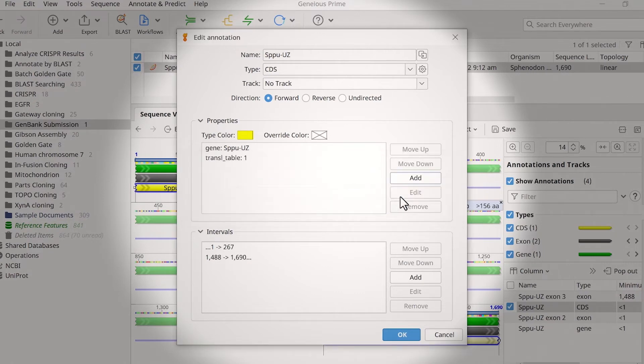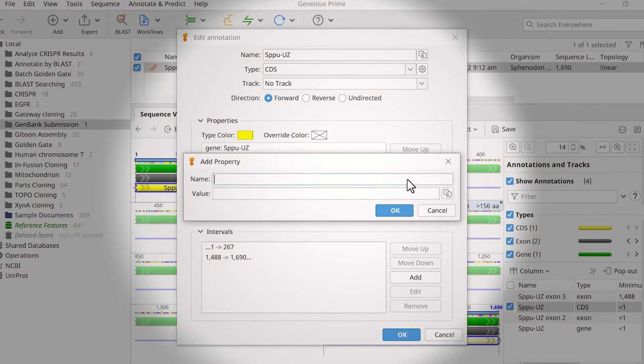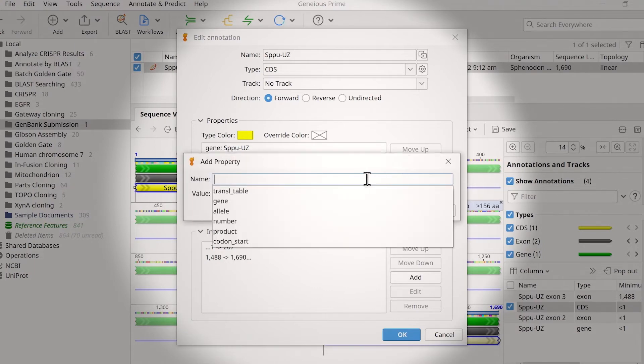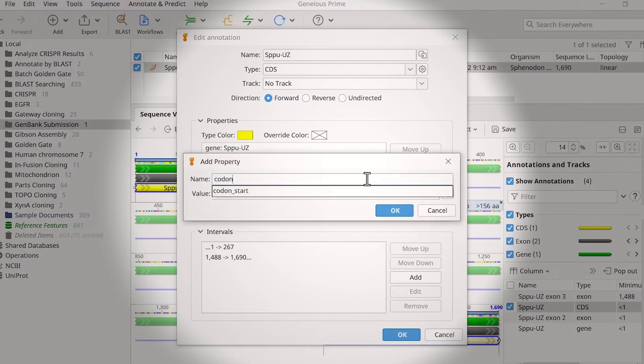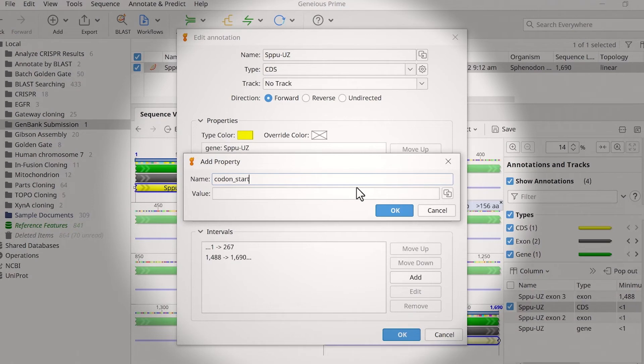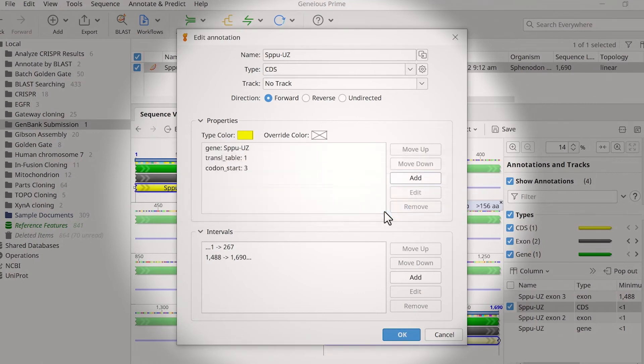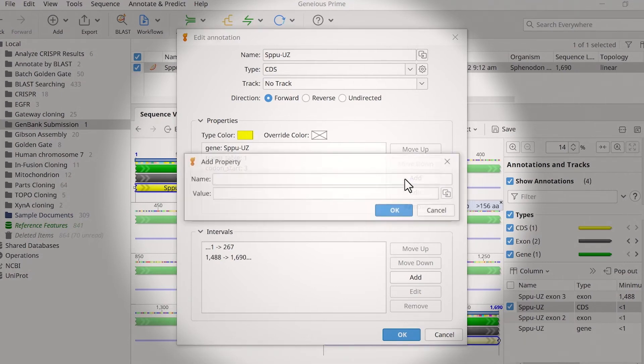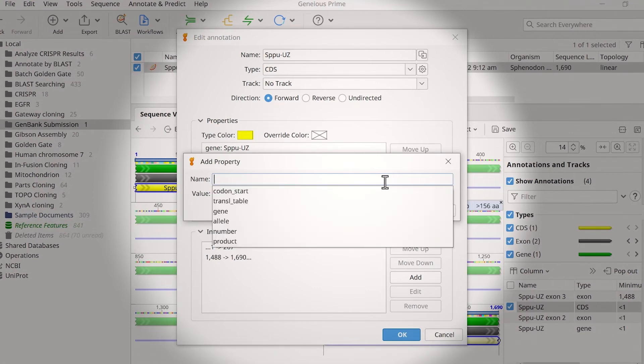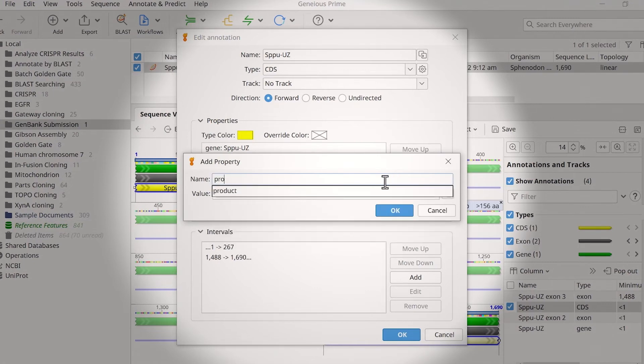Another qualifier required for all coding sequence annotations is the codon start. It has a value of 1, 2, or 3, and indicates the offset at which the first complete codon of a coding feature is found relative to the first base, 3 in this example. GenBank will use the information entered in the translation table and codon start qualifiers to create the protein translation for the submission. Lastly, coding sequence annotations also require a product qualifier describing the protein name.